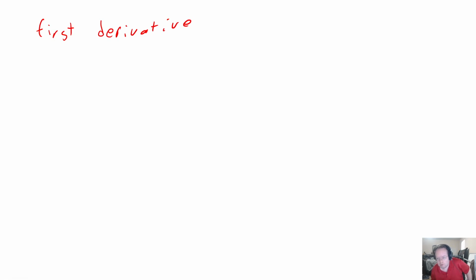Okay, so I'm going to talk really quickly about how to do a first derivative test to use for your titrations. I'm going to talk a little bit first about what I'm doing, and then I'm going to show you how to do it in Excel.